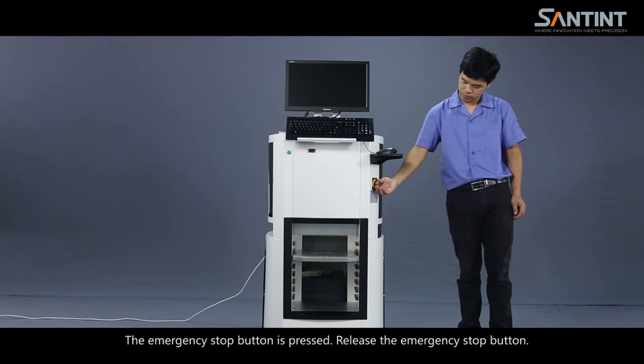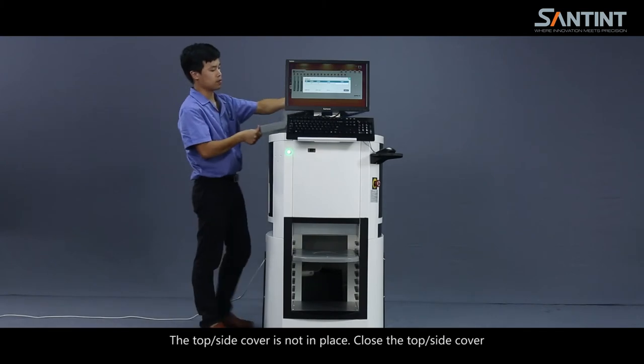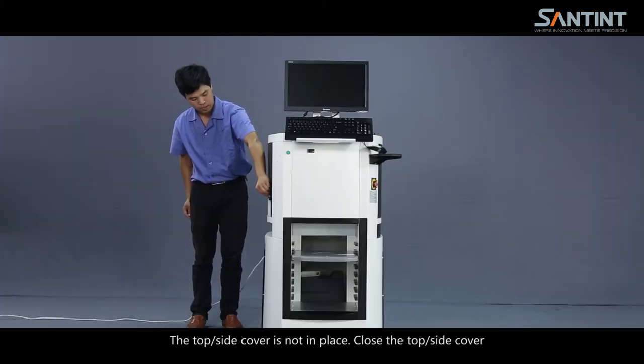Machine troubleshooting. Error code 11: the emergency stop button is pressed — release the emergency stop button. Error code 12: the top side cover is not in place — close the top side cover.